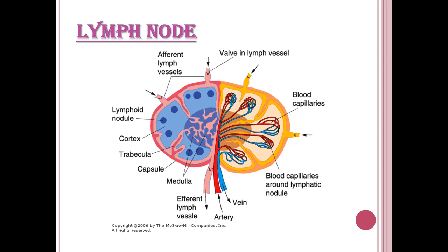Multiple afferent channels at the periphery allow lymph to enter the lymph node, while a single efferent channel at the hilum allows cleaned and filtered lymph to exit into the lymphatic channel. Blood capillaries are visible around the lymphatic nodules. Trabeculae, which are extensions of the capsule, send septa inside dividing the node into different lobes and lobules.